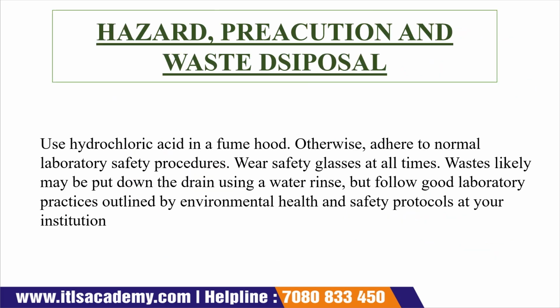Okay, now the next one is your hazard precaution and waste disposal. We all know that we are using hydrochloric acid, and it is hazardous. So when we are using it, we have to take care and use it in a fume hood, and we also follow all the laboratory safety procedures, that is normal, like wear safety glasses, a lab coat, a mask, and gloves.